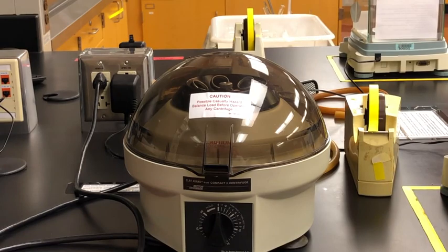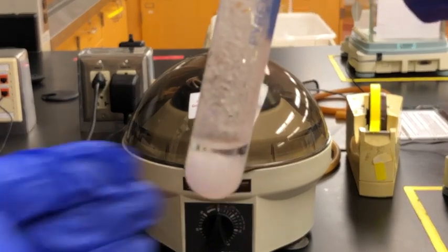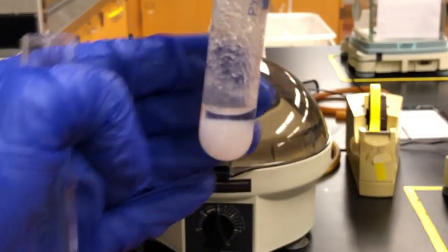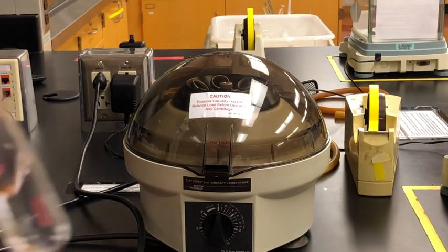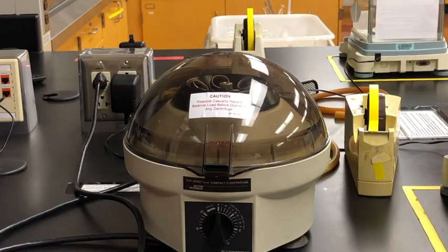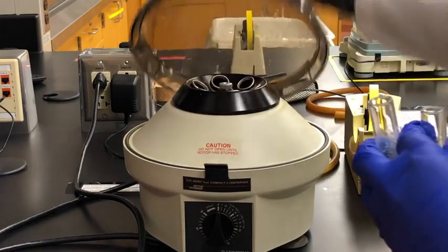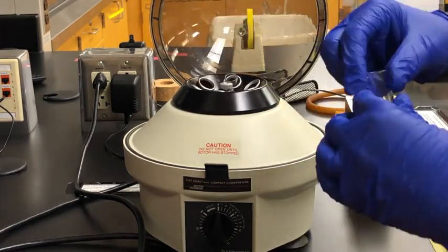After five minutes of cooling we should have a significant amount of crystals in our test tube. Now we're going to further isolate the solid from any liquid using a centrifuge. This centrifuge needs to be balanced in order to work, so we're going to place a test tube of water across from our test tube with our sample.